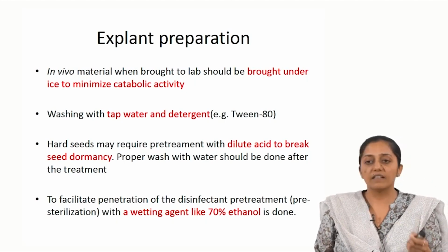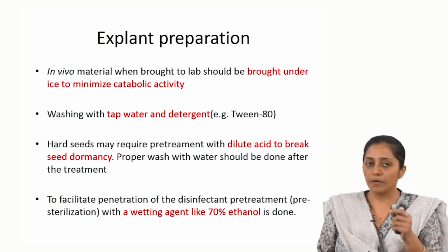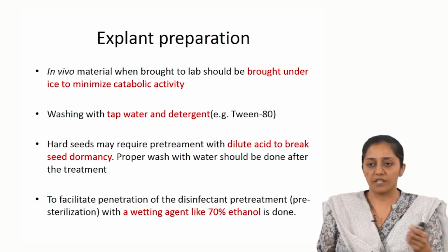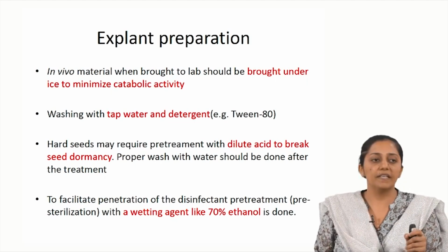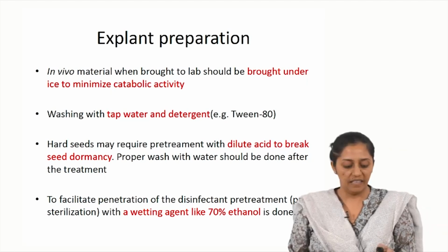So the acid treatment or heat treatment can help in removing this coat, so that with exposure to conducive environmental and media conditions, the seed can sprout into the seedling.